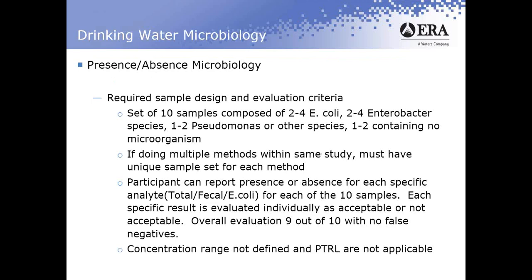Start with the presence-absence microsample, the required sample design and evaluation criteria. This is information that's all presented on the drinking water FOPT tables and is the basic guideline that all the PT providers have to follow to design their samples to. And it's on the drinking water FOPT table.